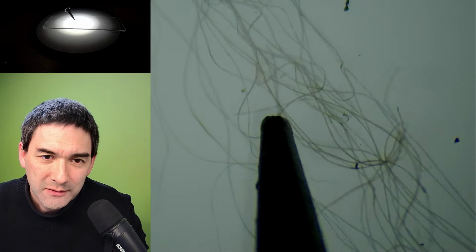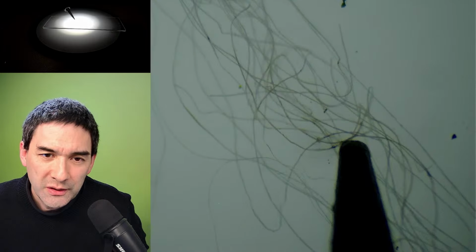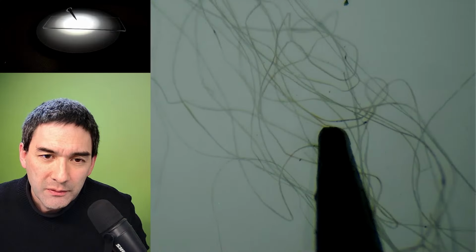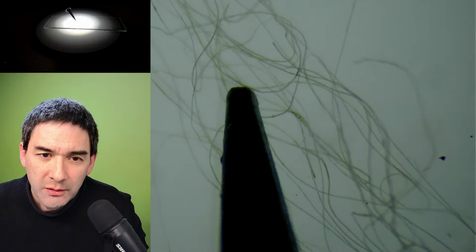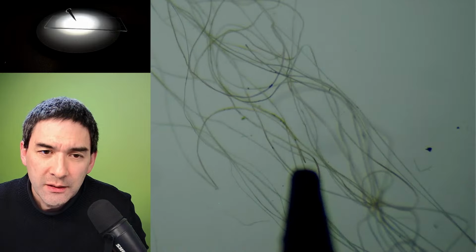There are also certain stains and dyes that you can use, because plastic, synthetic ones, are hydrophobic, right? And therefore certain stains will actually adhere better.